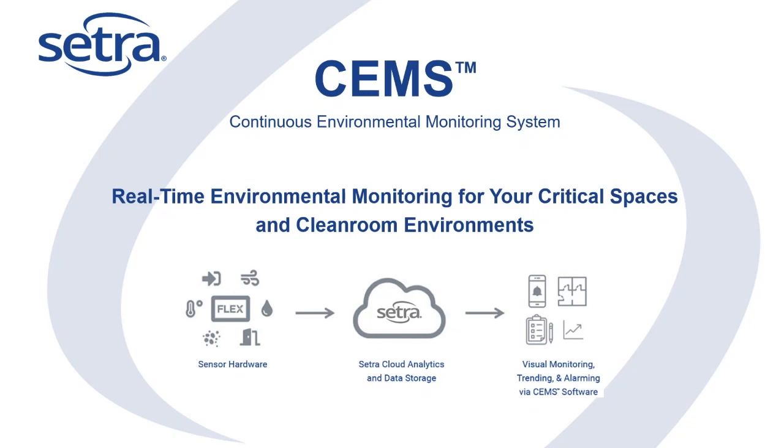However, it is important to keep in mind that the Cleanroom is only one example of a CEMS application. CEMS can be deployed to monitor operating rooms, isolation and treatment suites, compounding pharmacies, pharmaceutical laboratories, vivariums, regulated manufacturing, and more. At its most fundamental level, CEMS collects real-time data from in-room sensors and provides actionable information back to users.